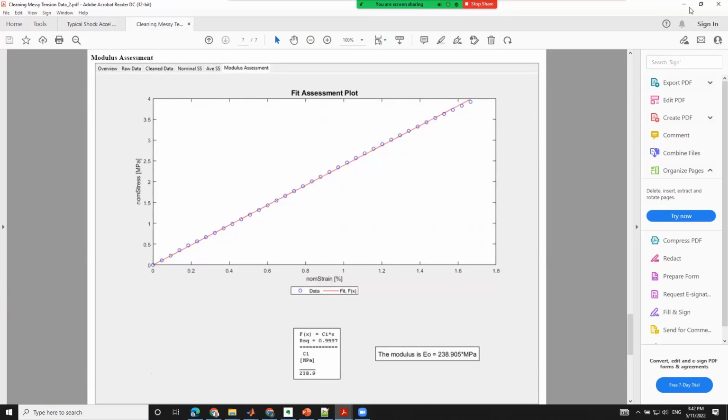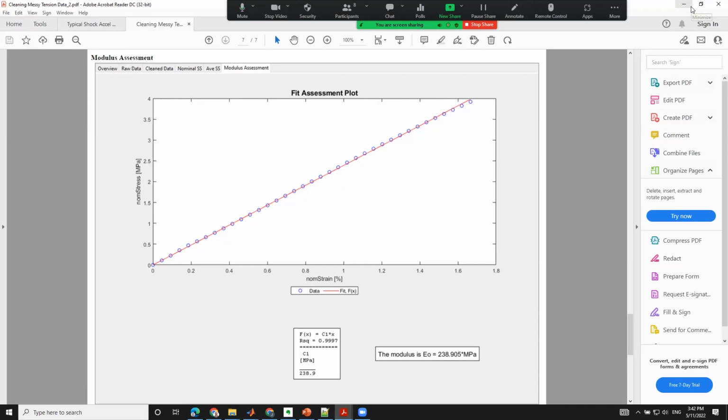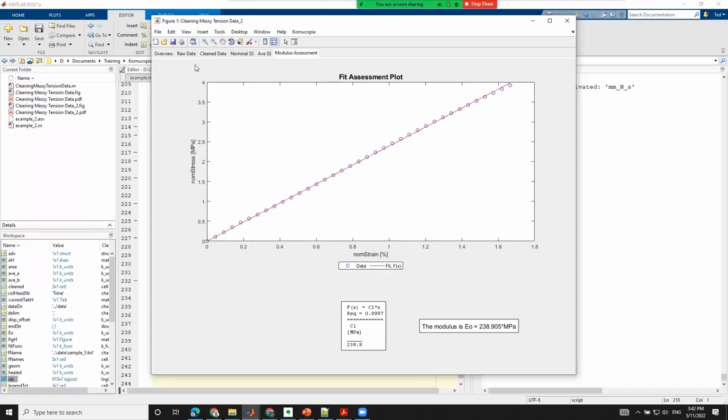So workflows that I typically do when I'm doing measurement work, I might measure 20 or 30 data sets. And these kind of things will have multiple layers of tabs, one for each data set, and a tremendous amount of information in there. And then I dump out this nicely documented PDF and have given the person an effective report in a few minutes. That's a really efficient way to store your data.